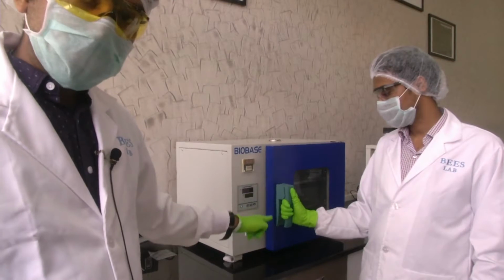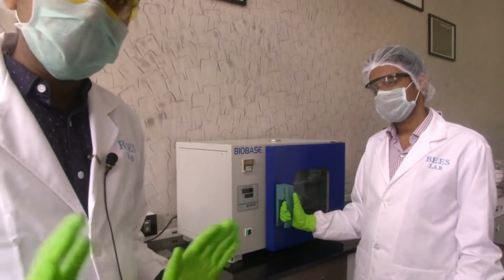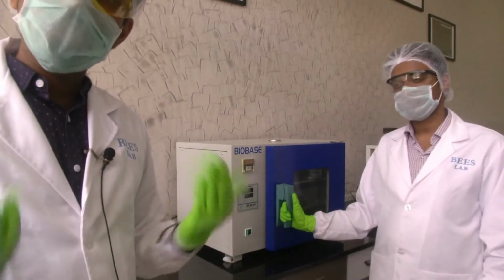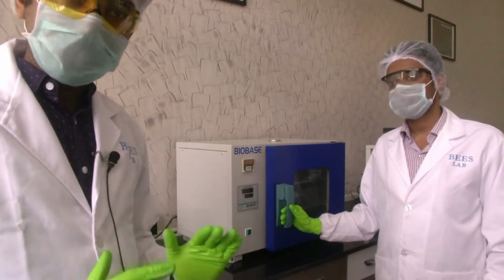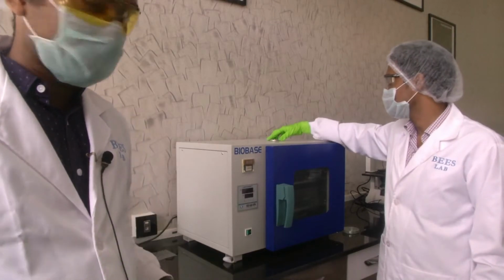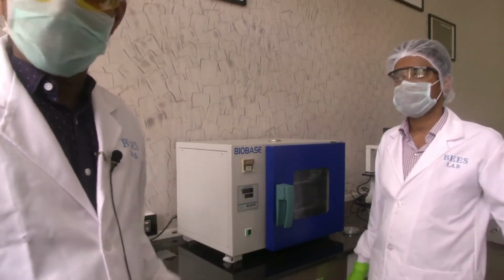Now the temperature inside is very high. 60 degrees Celsius is okay, you can still open it, it is not a problem. But if we set it at a temperature like 200 degrees Celsius, do not just go ahead and open the door. Wait for the system to settle down, come down to a normal temperature, and then open it. So let us wait for a few minutes and then we will open the door.